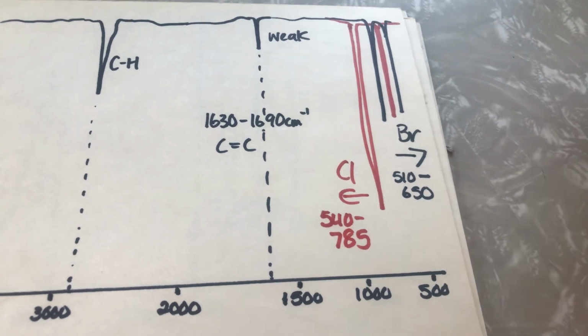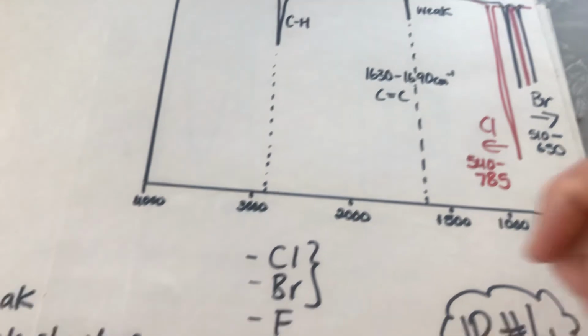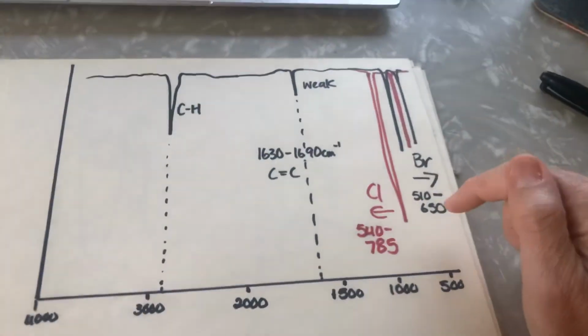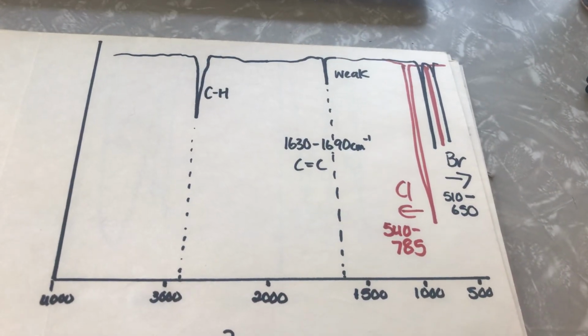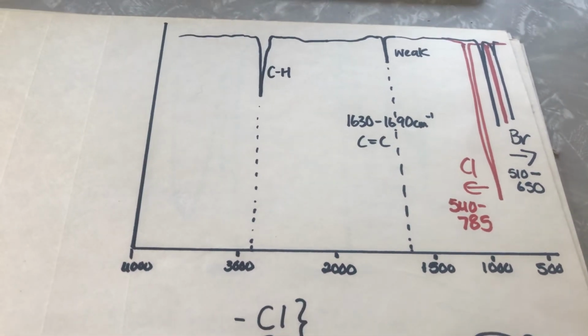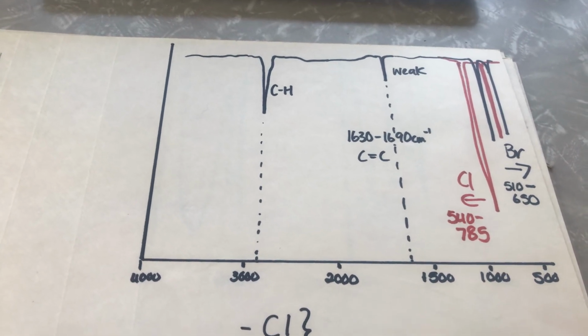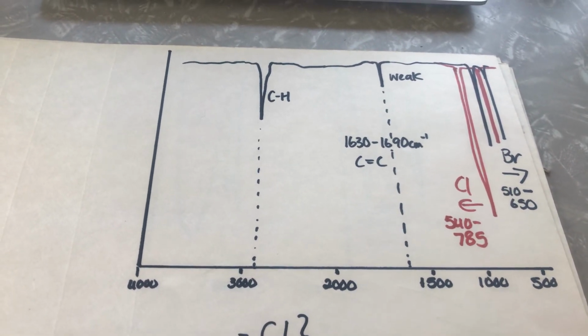and that, along with our C to H peak, will give us evidence when we analyse and interpret for a haloalkane. And that wraps up infrared spectroscopy. So last reminder, what are we getting out of infrared? We are looking for the presence or absence of functional groups.